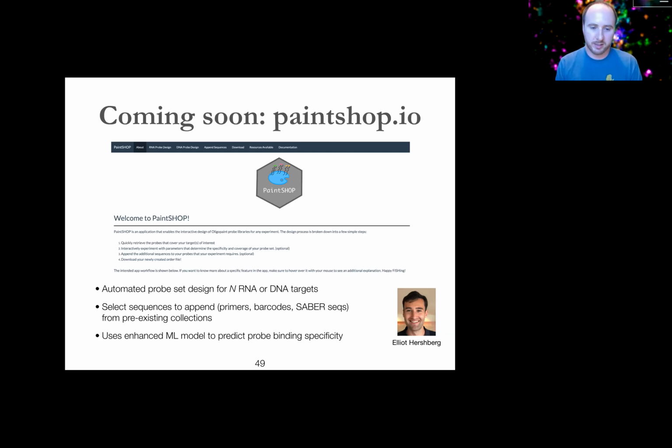So it does n-dimensional set design. If you want to target 100 different transcripts and do something ambitious, it simplifies all that for you. All you need to know are the RefSeq IDs of what you want to target. We automatically take things like strandedness of the target, if it's an RNA, into account to make sure you get the right oligo. You're actually targeting the RNA, instead of synthesizing a probe with the same strand as the RNA, which would miss it.